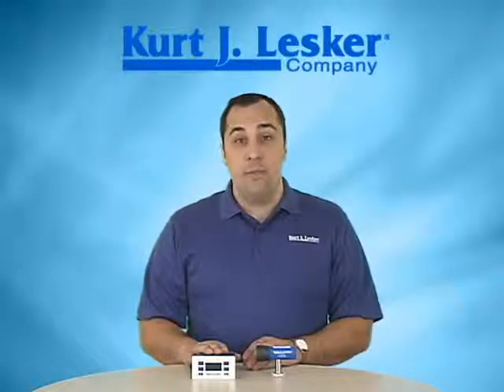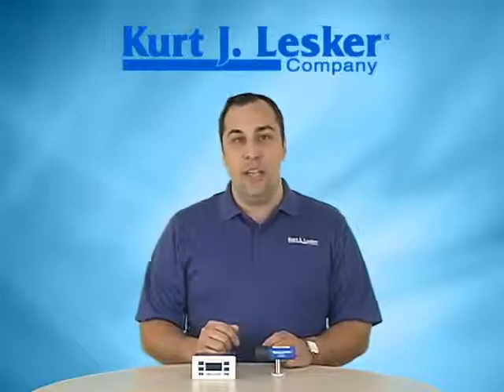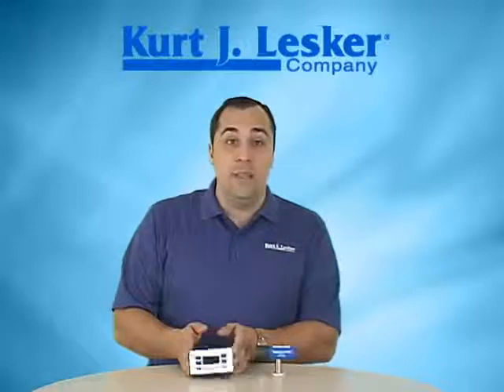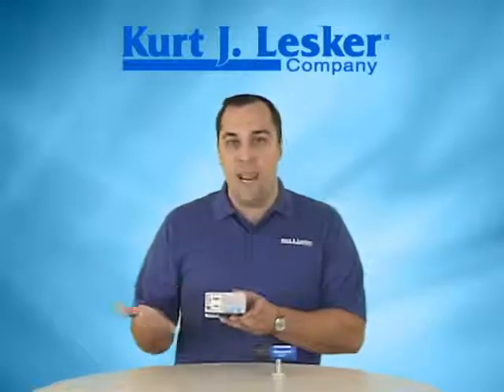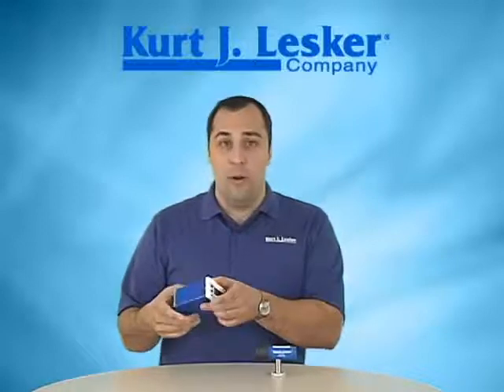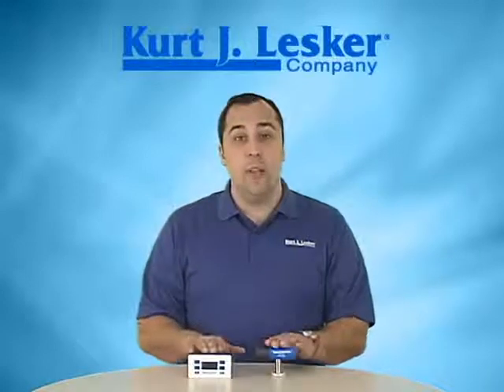The 375 controller and 275 gauge tube make a reliable, affordable, high-quality gauging package to measure rough and medium vacuum. The 275 tubes are direct pin-to-pin drop-in replacements for Granville Phillips 275 Convectron tubes, and the 375 controller has a lot of different features, including two set points, user-selectable analog output — either linear, log linear, or a non-linear S-curve — and it also offers RS-232 and RS-485 communication.